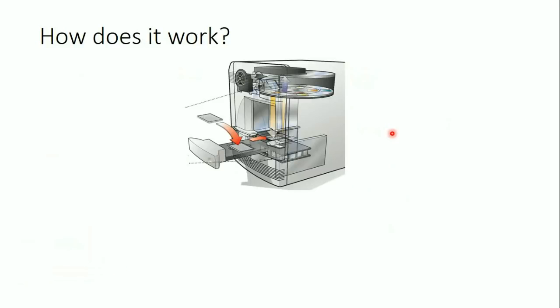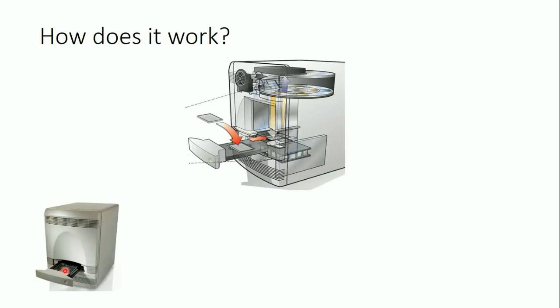So this is a diagram of the real-time PCR machine. So here is what we call the tube patch. It looks like this from outside. So here is where we put our tubes. Normally we use plates because we can apply real-time PCR to several samples at one time. So we can use the 96 wells plate or whatever.